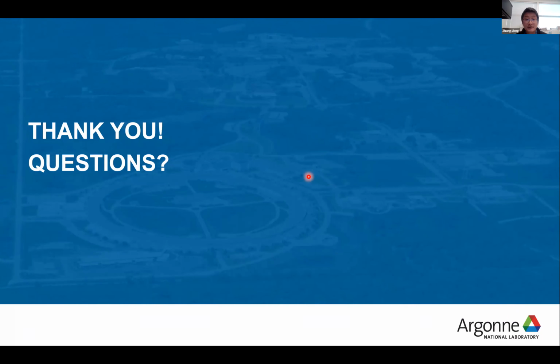Okay, thank you, Joe, for your beamline introduction. Are there any questions for Joe? Yeah, I had a question. Okay, yeah, go ahead. The question is simply, what's the situation for users being able to bring their own modest chamber and install it?